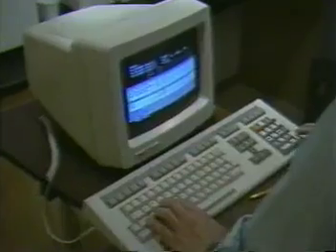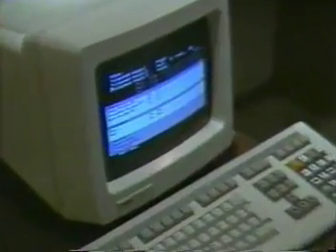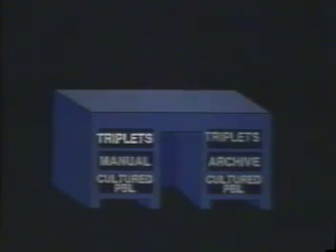To prepare his desk for data collection, Tom shifts his protocol drawer into collection mode and selects the appropriate label for his first sample. When FACS Desk goes into collection mode, the Magic Secretary really starts earning its title. For its first trick, the Secretary transforms the triplets protocol drawer into a collection drawer, while simultaneously installing a new analysis drawer onto Tom's desk. Both drawers will be labeled with the same title that Tom entered earlier for his protocol.